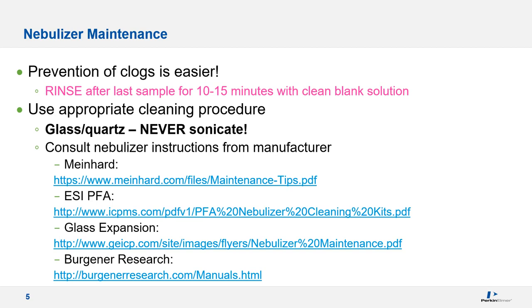I've included a few relevant links to the commonly used nebulizer maintenance pages. One key thing to remember is to never sonicate a quartz or glass nebulizer, because sonication will destroy it. You can also use a back-flush device — just make sure it is appropriate for your particular nebulizer. You can also soak the nebulizer in a special cleaning solution such as RBS 25, which is recommended by some nebulizer manufacturers. And finally, always have a spare nebulizer; you won't be able to run any samples until you get a new one.